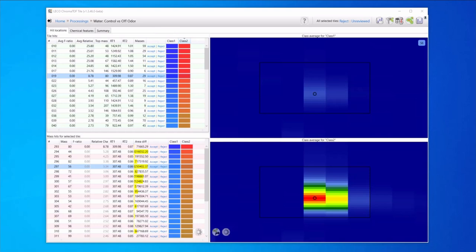After processing, the software points us to these locations in the chromatogram that meet all of the thresholds. This information is compiled for review here in the hit location window.